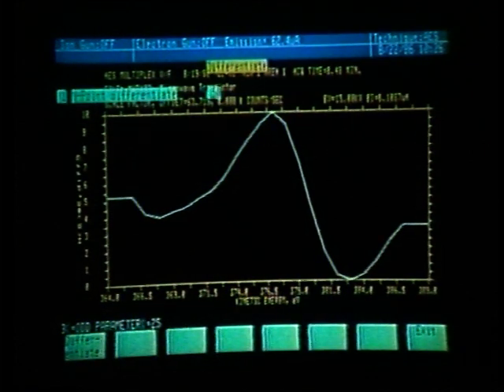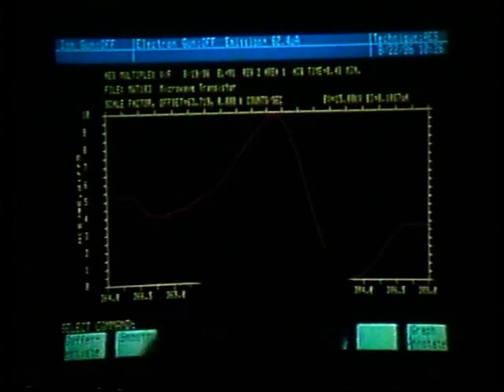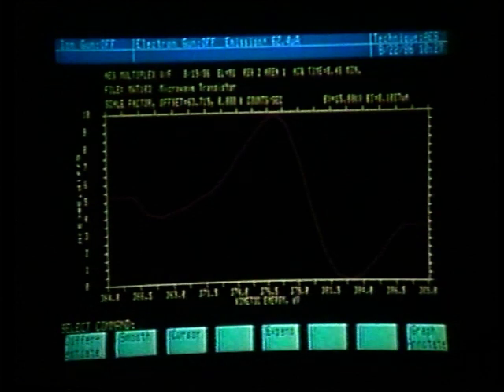And exit the differentiation mode, soft key number 8. We now see the differentiated nitrogen peak using a 5-point differentiation. Once again, we also see that the window is set correctly and that we will get an accurate atomic concentration calculated for the differentiated nitrogen peak.